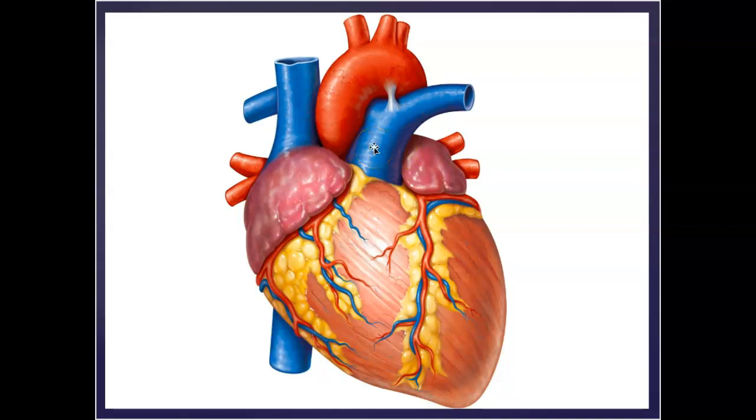So you'll have that done, and at that point you'll feel like, boy, I cut the superior and inferior vena cava, I cut the aorta before the arch, I cut the pulmonary trunk. Boy, this thing should pop right out, but it doesn't. Actually, the tricky part is yet to be done. What's holding the heart in place, and rather strongly, in fact, is the pulmonary veins. You can see them entering back here, coming into the left atrium.